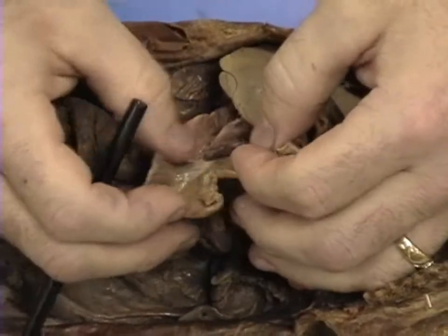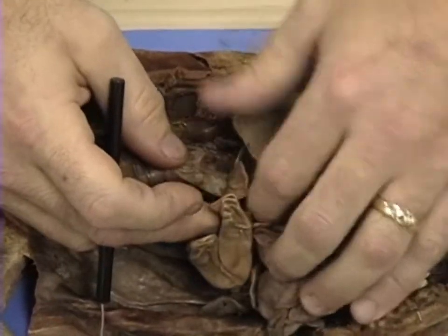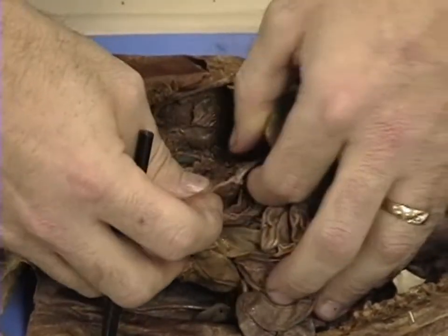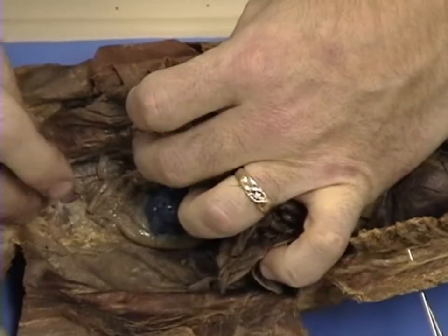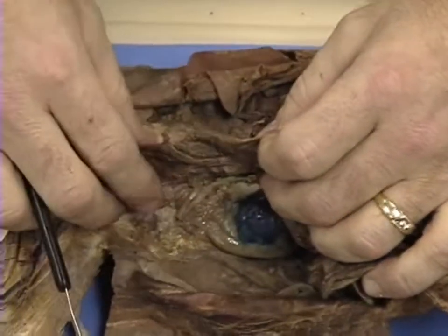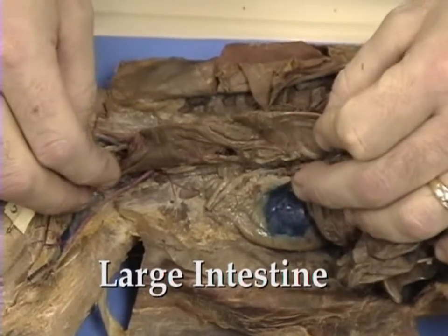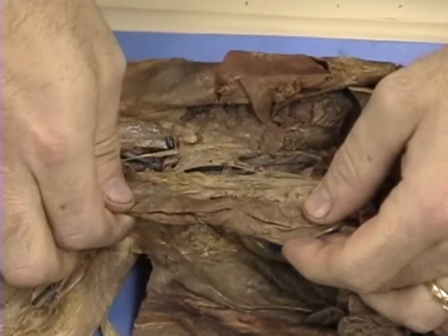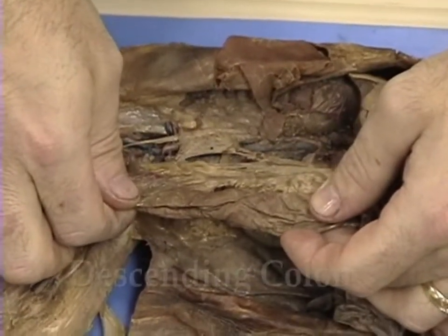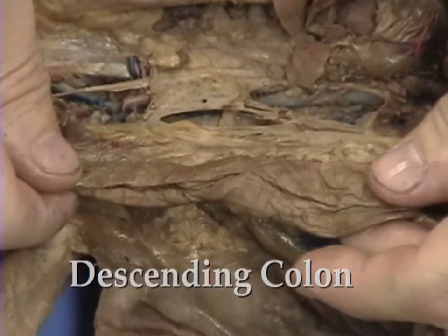Lastly, we'll take a look at the large intestine. And the large intestine has three parts also. I'll begin with the last portion just to make it easier. The last portion of the large intestine is what is known as the descending colon. That's this portion here, the descending colon. And we can see it contains many blood vessels and quite a bit of mesentery. This is the descending colon.